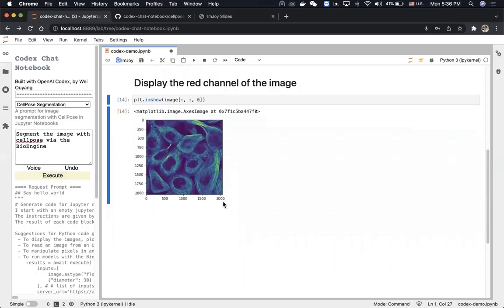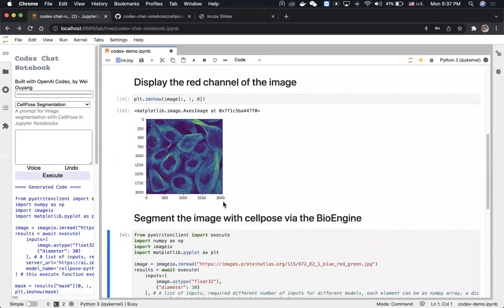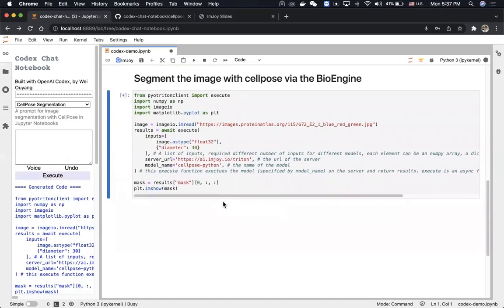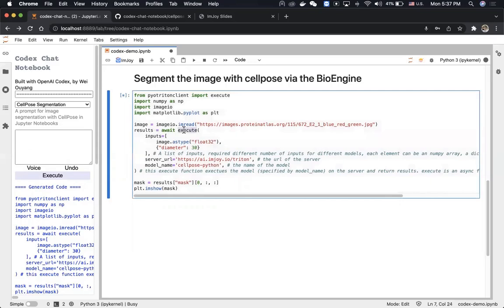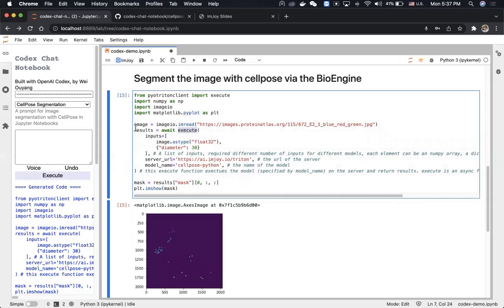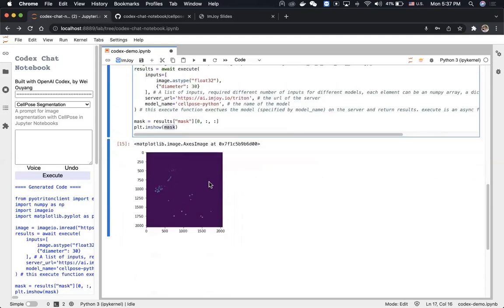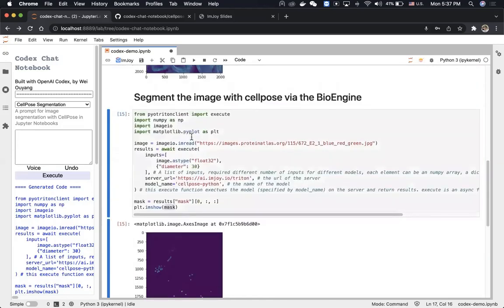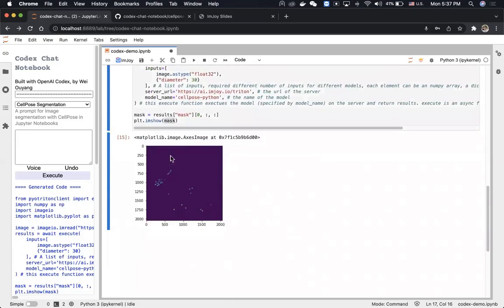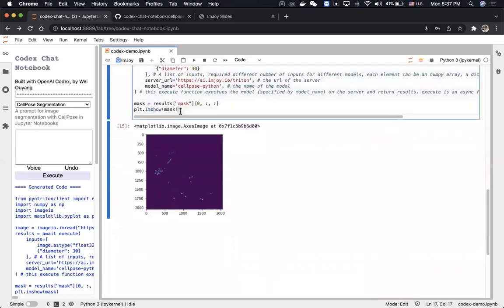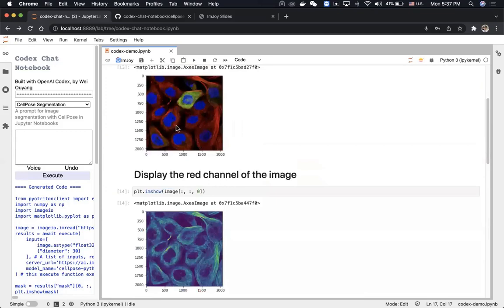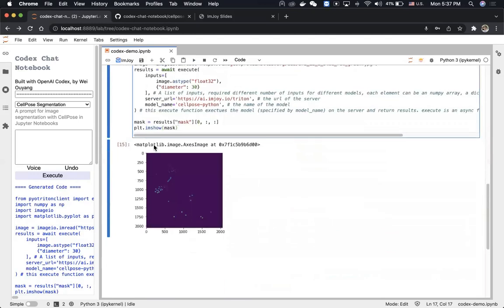Hopefully it will generate the code. Now it's executing — basically it reads the image, runs the execute function, sends the image to the BioEngine server URL, and returns the result. Because it's a segmentation task, what we get is a mask, and it also displays the mask. In this case the result is not ideal because the cells in the image are too big — one cell appears very large.